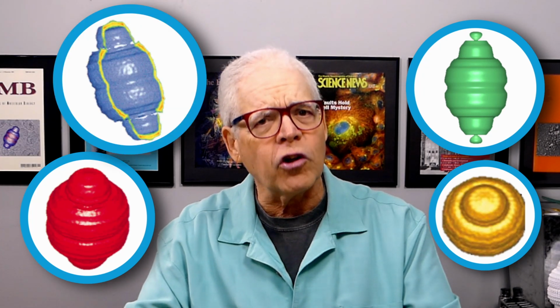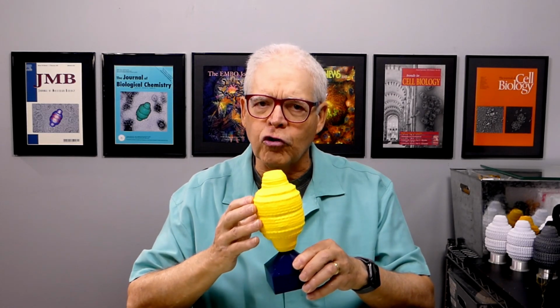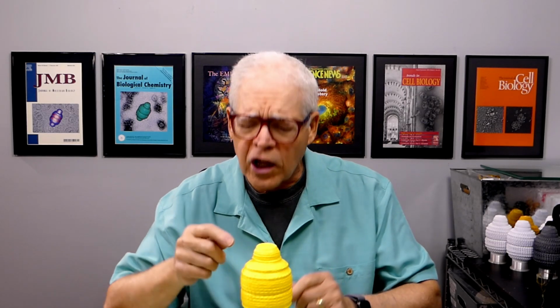In the last 2 videos, I introduced cryo-EM reconstruction, and I showed you lots of vault reconstructions that were carried out on thousands of particle images, giving moderate resolution, but still relatively low, in the neighborhood of 20 angstroms. Here's a model I made of the 20 angstrom resolution vault. Although cryo-EM was getting better, when this model was produced, we couldn't see individual MVP protein chains.